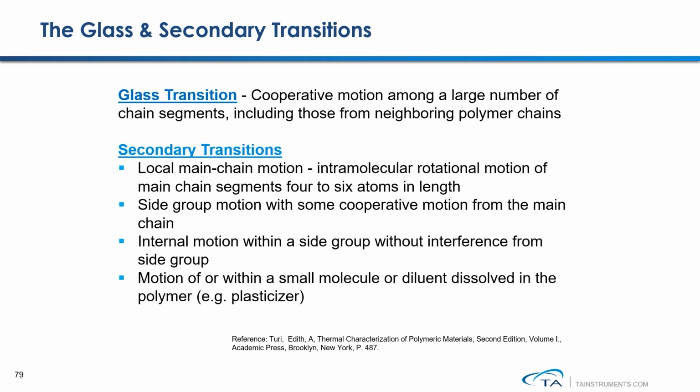In addition to measuring glass transition, this rheological temperature ramp test is also sensitive to all subambient beta-gamma transitions in polymers. Those subambient transitions are mostly associated with some local chain or side chain relaxation. Measuring these subambient transitions can help us study the impact strength of a material.